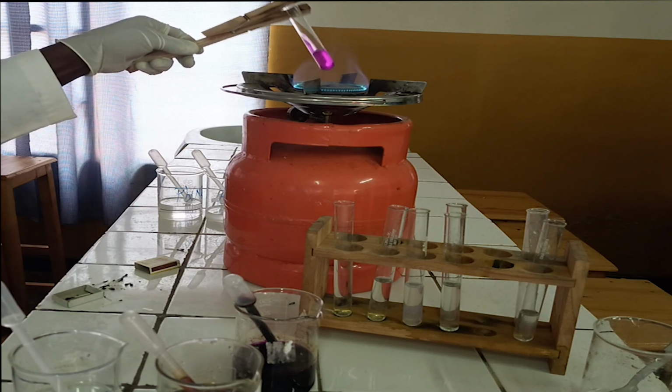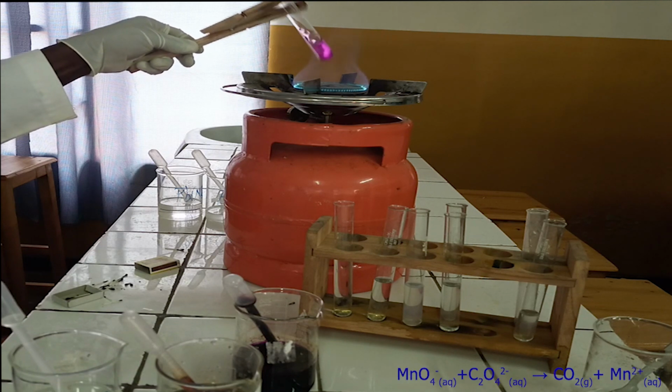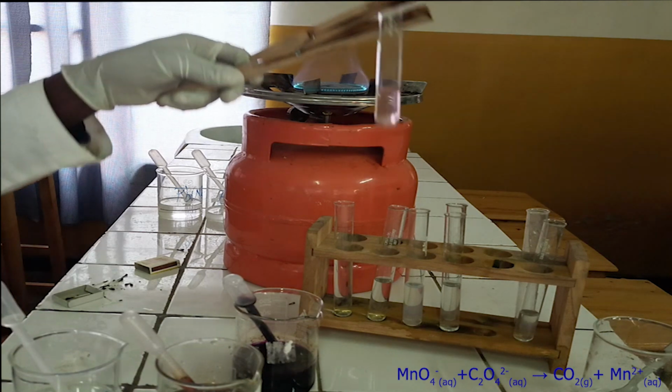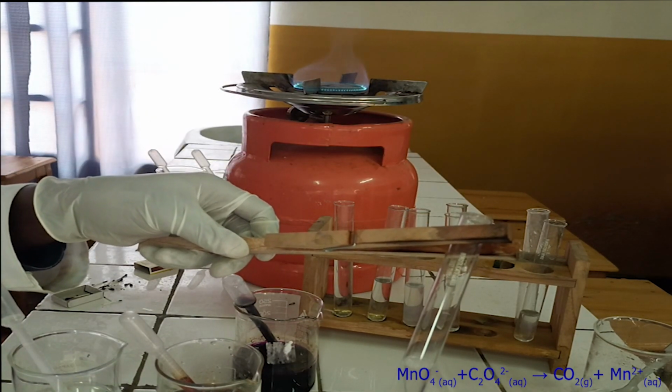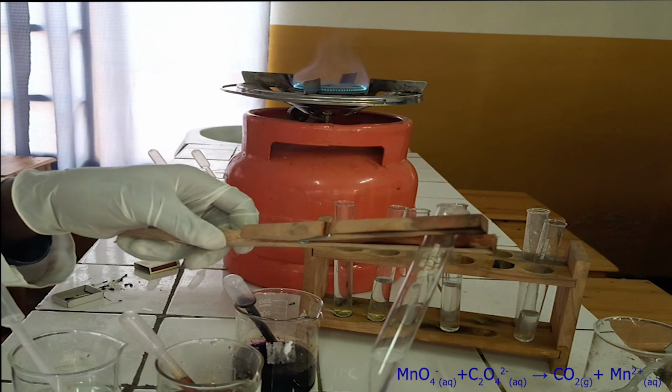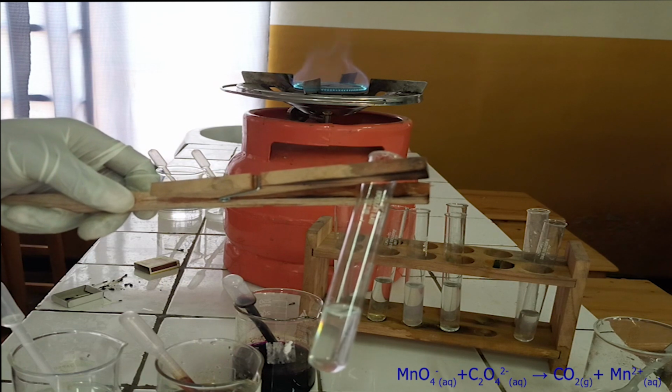As you see, on heating, acidified potassium permanganate solution reacts with oxalate ion. During reaction, purple color of potassium permanganate solution turns colorless. Below, there is the ionic equation for this reaction.